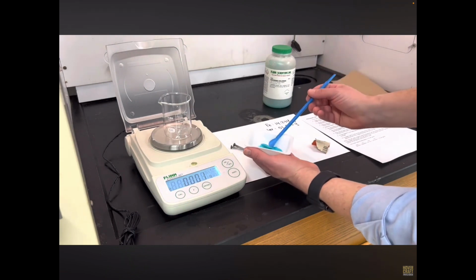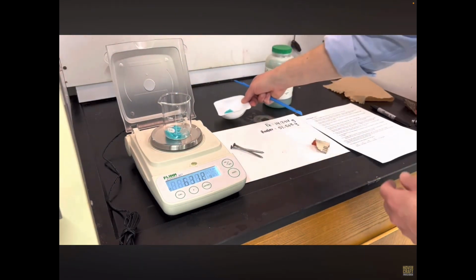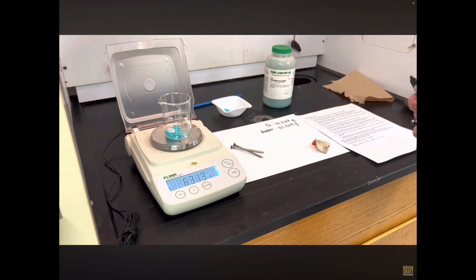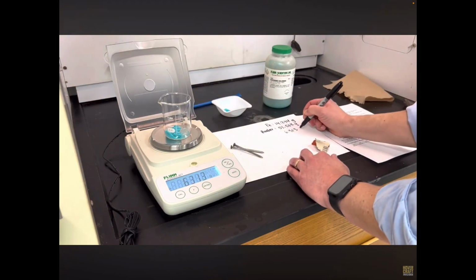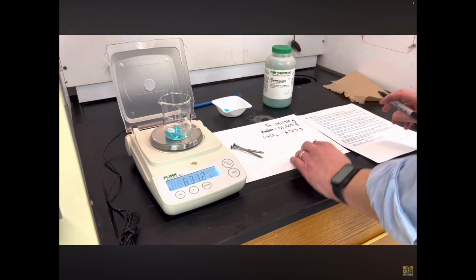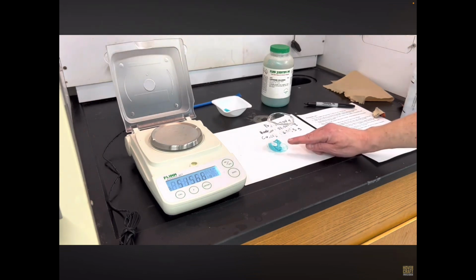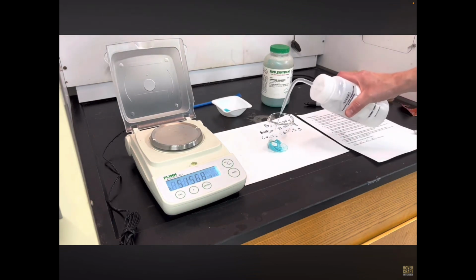So I'm actually going to take one of these bigger chunks, start with that, and that's about 1. And I'm over 6 grams, so I'm going to go ahead and use that value, 6.313 grams. That is my copper chloride. To dissolve the copper 2 chloride, it suggests about 60 milliliters, and on this particular beaker it is marked. I don't need to be exact, but around 60 milliliters will be a good amount.